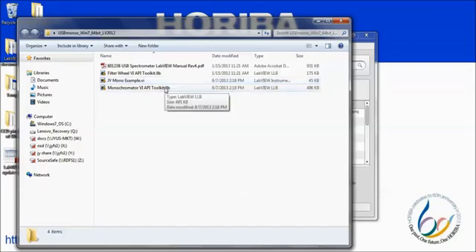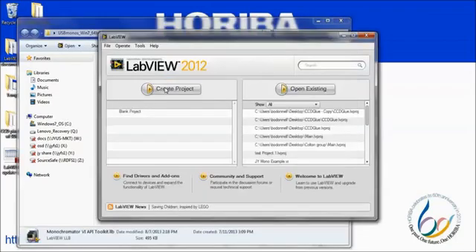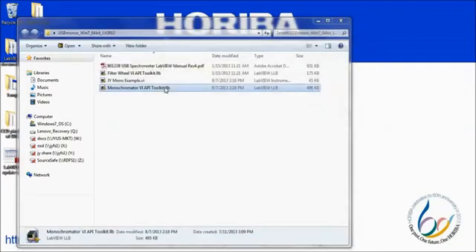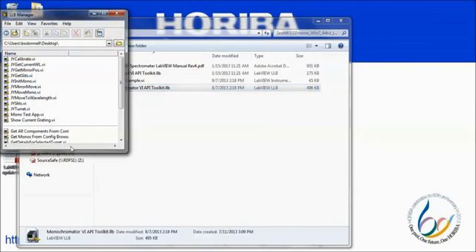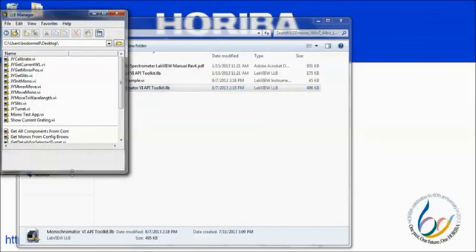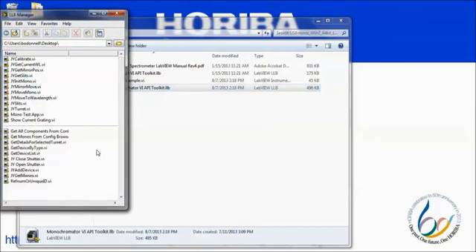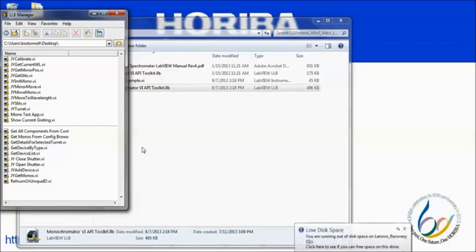Finally, we have the spectrometer toolkit. This library contains all of the sub-VIs that will be needed to develop any kind of code. If we open this library, we can see a variety of sub-VIs for reading parameters from the spectrometer and setting slit widths, mirror positions, turret position, and wavelength position. These sub-VIs represent the very basic building blocks from which more complex code may be developed.